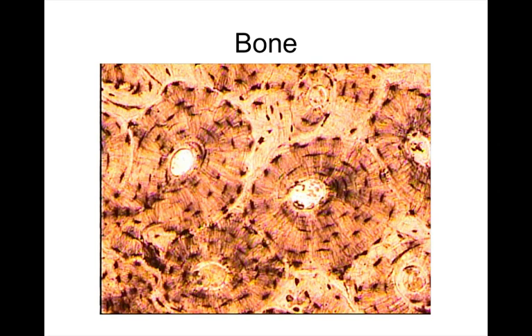They're fuzzy, actually, when we're going to see this when we talk about bone as a tissue. They're fuzzy because there are these little tendrils almost that extend from them. So it looks like it's blurry, but in real life there are little cracks. Those things are called canaliculi, so that allows each individual osteocyte to be connected to other osteocytes and also to have access to the central canal so they can get nutrition and stuff.